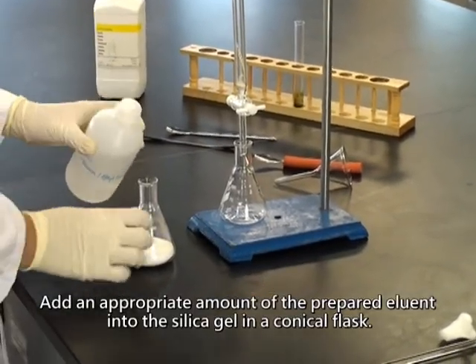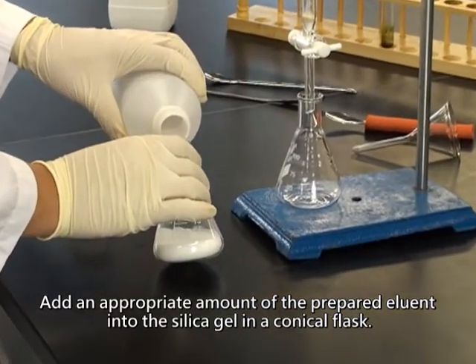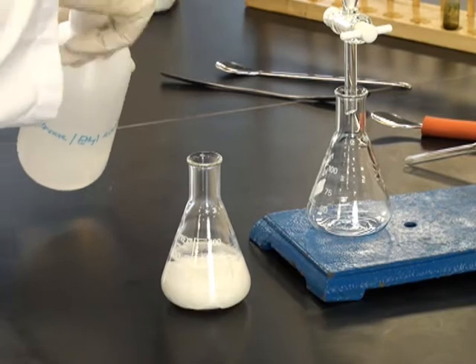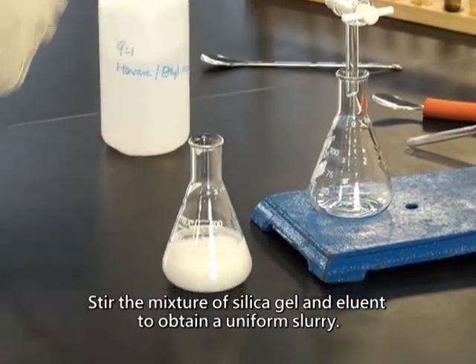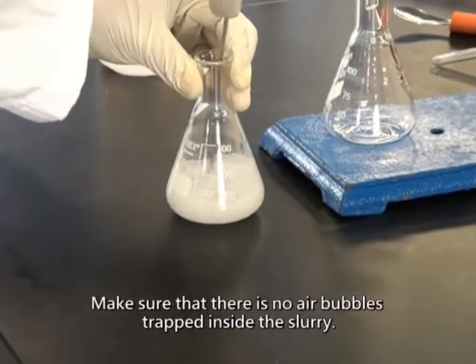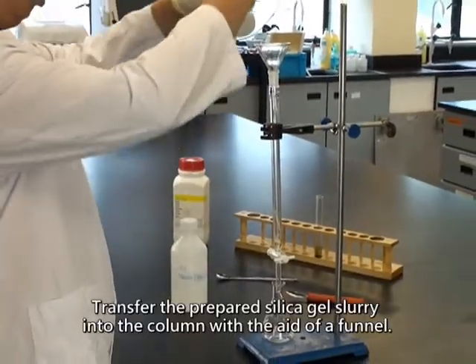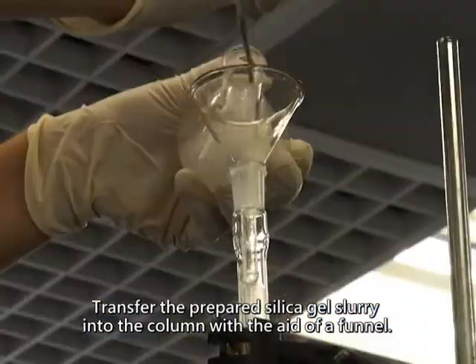Add an appropriate amount of the prepared eluant into the silica gel in a conical flask. Stir the mixture of silica gel and eluant to obtain a uniform slurry. Make sure that there are no air bubbles trapped inside the slurry. Transfer the prepared silica gel slurry into the column with the aid of a funnel.